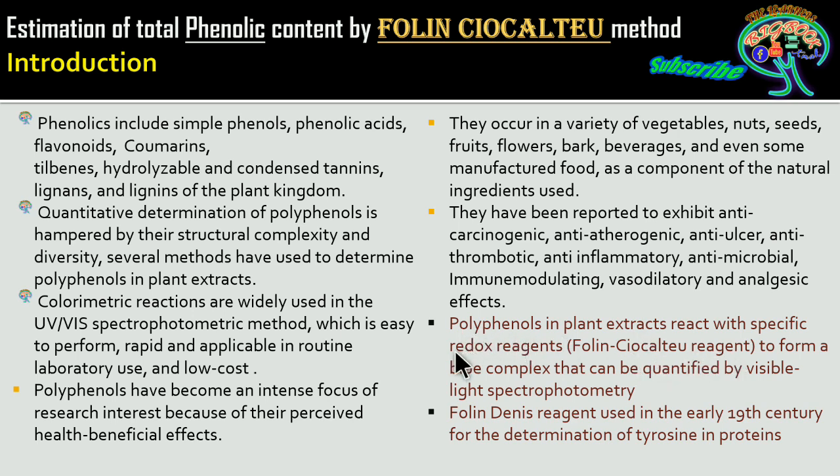Here, we identify the presence of polyphenols by the use of redox reagents, where the polyphenols are self-reducing substances in the presence of oxidizing agents, that is the redox agent, to form a blue complex that can be quantified by visible light spectrophotometry. As we have discussed, the quantification will be with the help of visible light spectrophotometry.